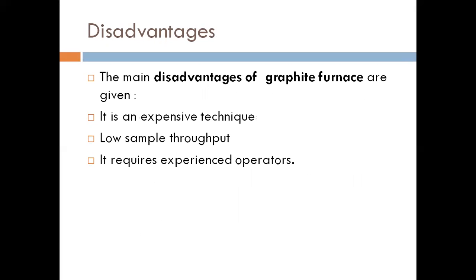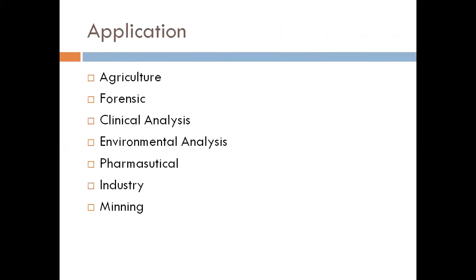And the disadvantages of GFAAS: it is expensive and has low sample throughput, so it requires an experienced operator. Next one is application. Applications are in agriculture, forensic, clinical analysis, environmental analysis, pharmaceutical, and industry and mining.